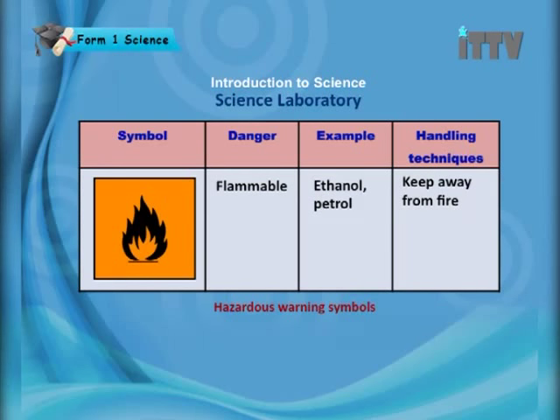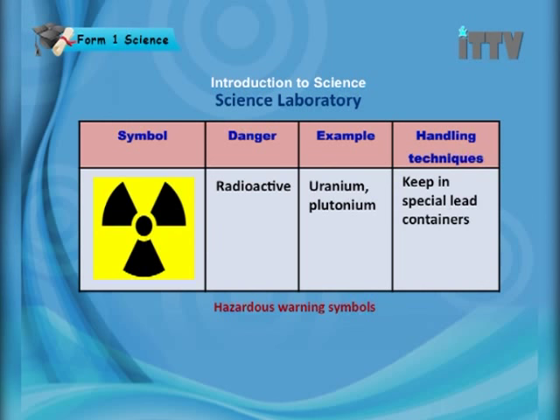Have you seen hazardous signs before? These signs appear on the labels of bottles to warn you. A flame symbol indicates that chemicals are flammable — examples include ethanol and petrol. Keep them away from fire. A fan-like symbol indicates radioactive material — examples include uranium and plutonium. These should be kept in special lead containers to prevent radioactive rays from escaping.